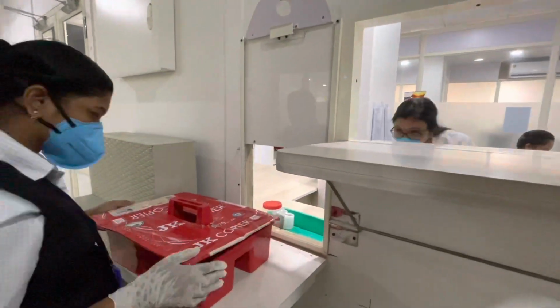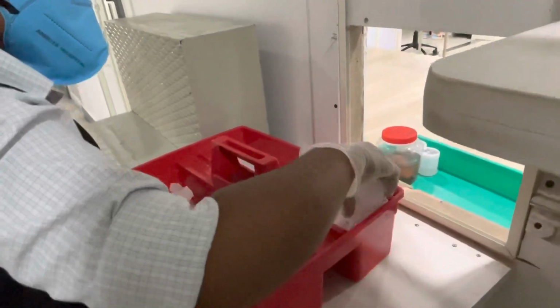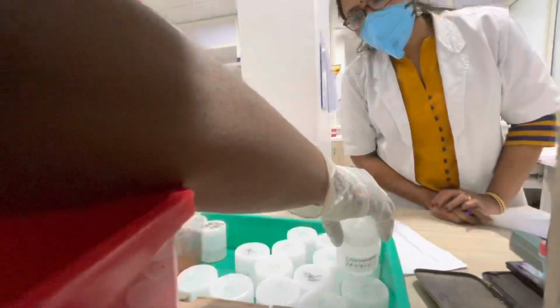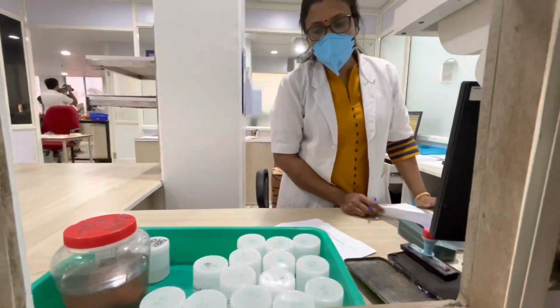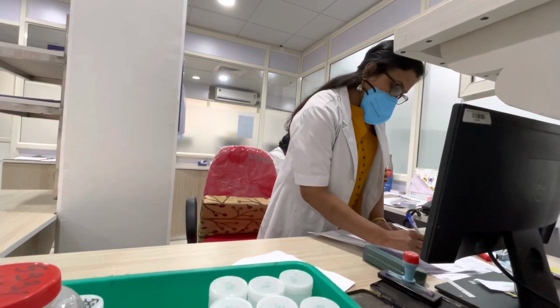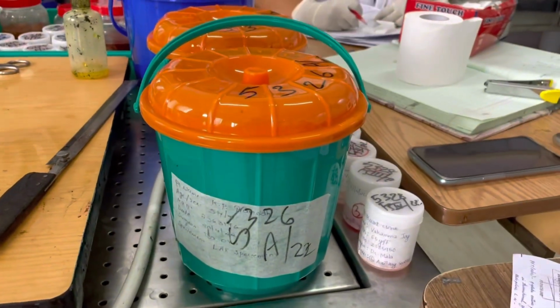The sample is placed in a wide mouth container. An adequate fixative is added. The sample which has come for testing should be properly labeled with the person's name and, most importantly, their MRD number. The MRD number of the sample is cross-checked with the one on the form by the lab assistant.